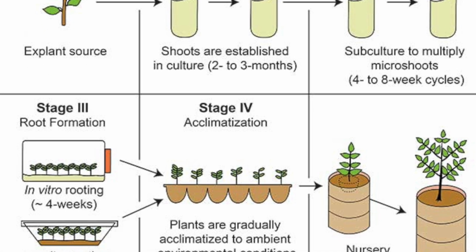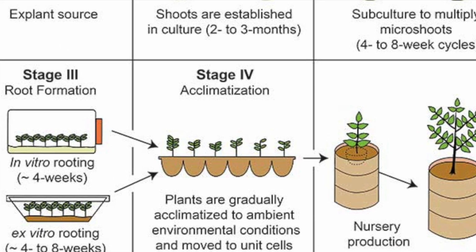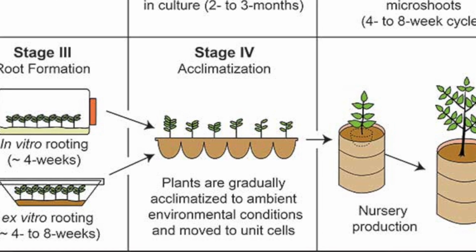Alright guys, so if you made it this far into the video, we are basically at the last stage. And so now you have your plant grown, it's rooted, and now it's ready to be grown outside of tissue culture, taken out to the field, the greenhouse, or whatever you're going to grow into. But how do you do it?